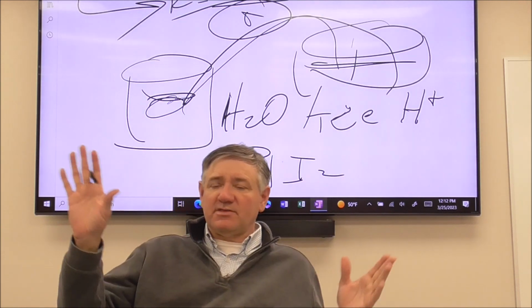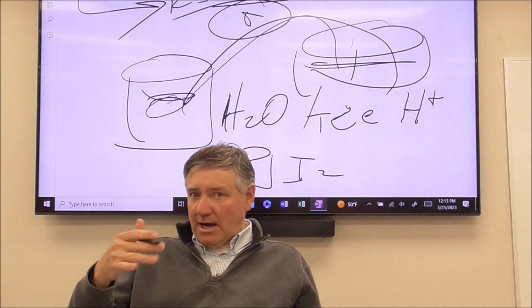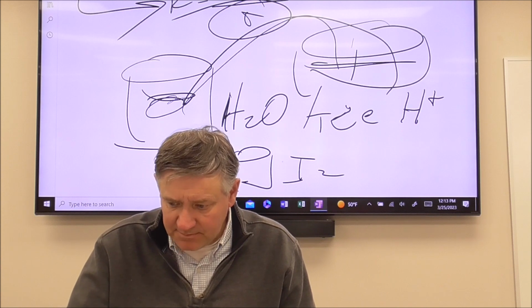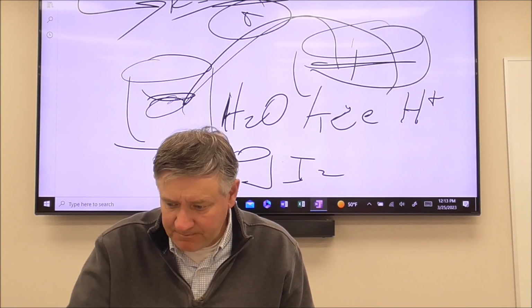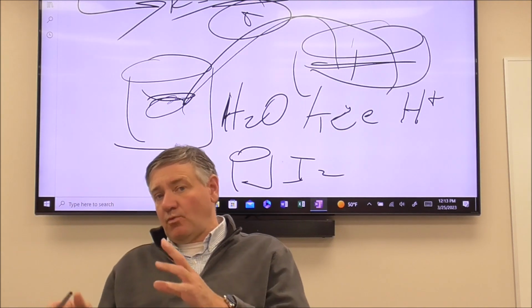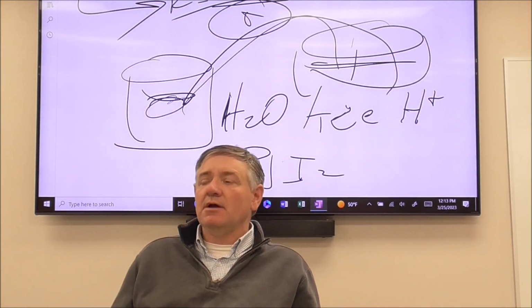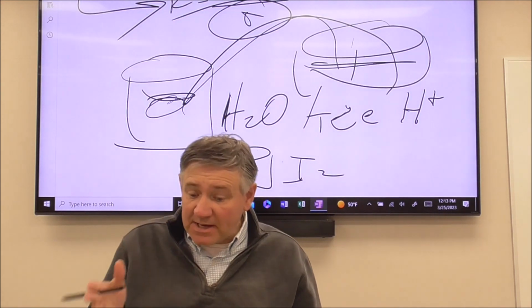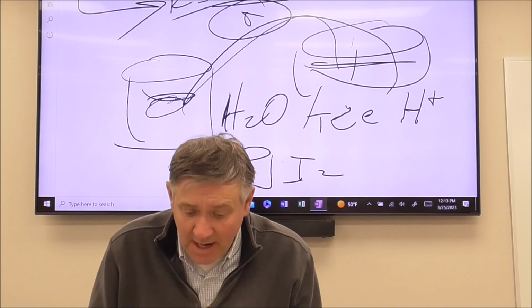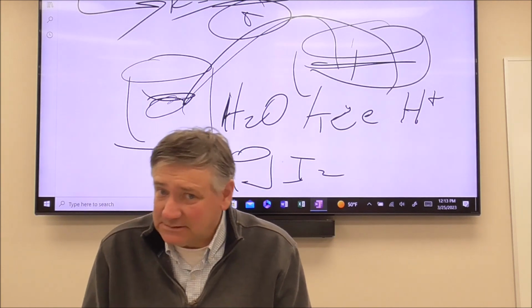Now, because we have an ambient temperature of about 20 degrees inside that room, depending upon how long this reaction takes, you want to monitor the temperature of the reaction, okay? And if that begins to warm up, you might have to put that back in the water bath again to chill it back down to about 10 degrees. Literally, this might take you a while, okay? When I did mine, it took about 5 minutes for it to run. So it might take a while.